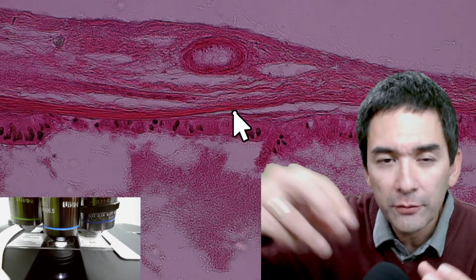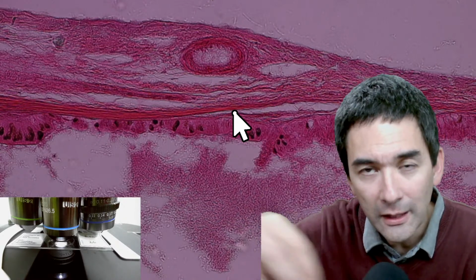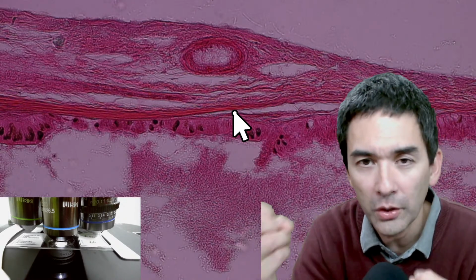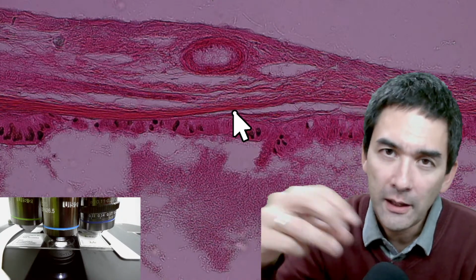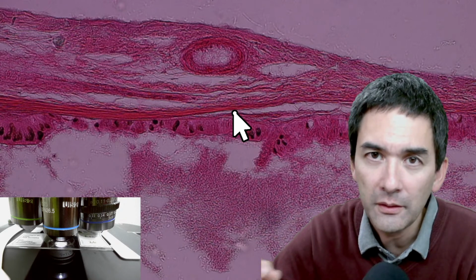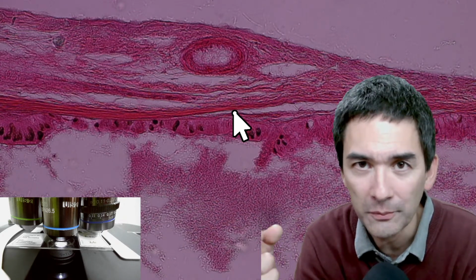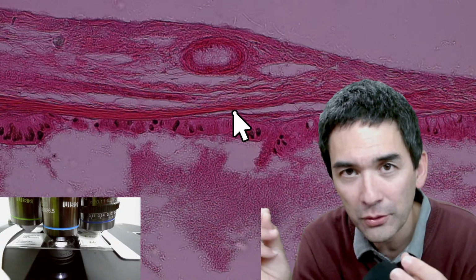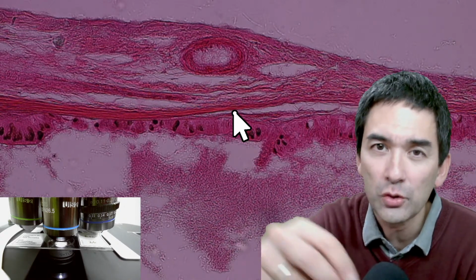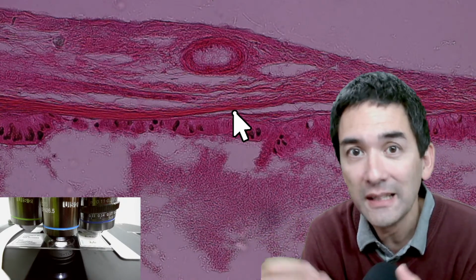And then basically you have to dehydrate it. This means that you increase the alcohol concentration until all of the water has been removed. You have to increase it stepwise so that it doesn't shrink, so you have to give the alcohol some time to replace the water. After you've used ethyl alcohol, you have to transfer to isopropyl alcohol because this contains even less water.